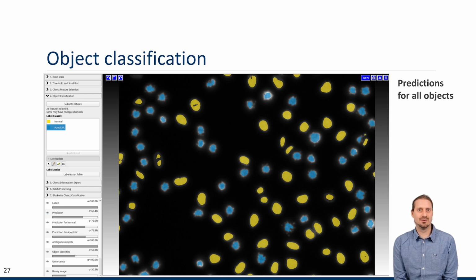And again, you might have been able to define all of this with rules by just looking at the intensities and the shapes, but it's a lot simpler here to just do this based on training data and let the machine learning model figure out how to separate the nuclei with this.